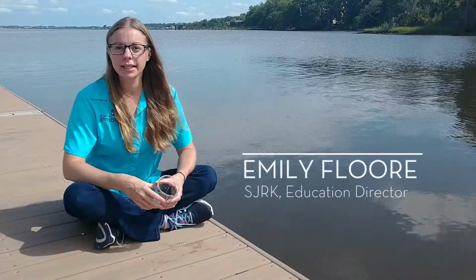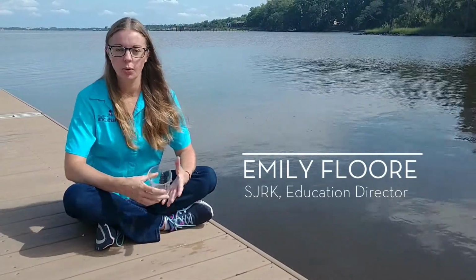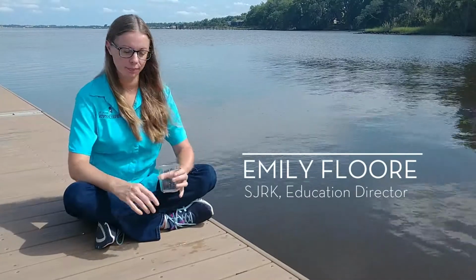Hey everybody, so we're at Jacksonville University. We're going to be measuring the salinity of our St. Johns River, and we're going to go ahead and collect our water sample.